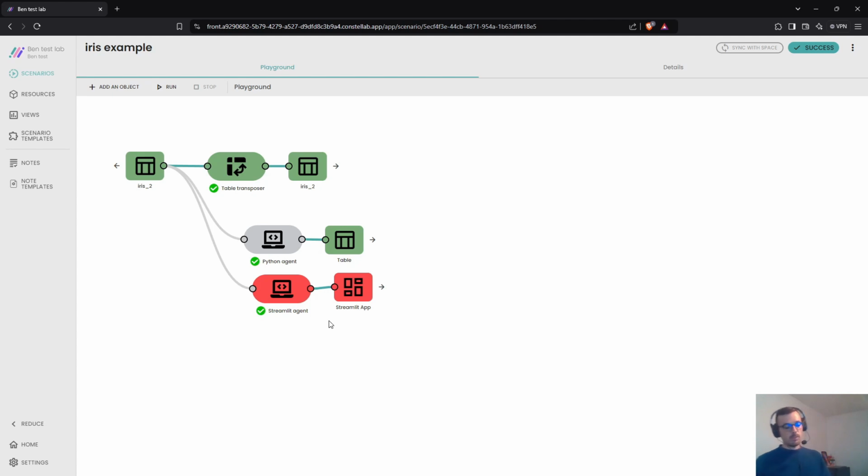If you want to develop in Constellab, I recommend our video about how to develop in Constellab, to show how you can create an agent, how you can create a dashboard, and how you can create the Codelab and use the Codelab environment. Okay, so that's it about the configuration.